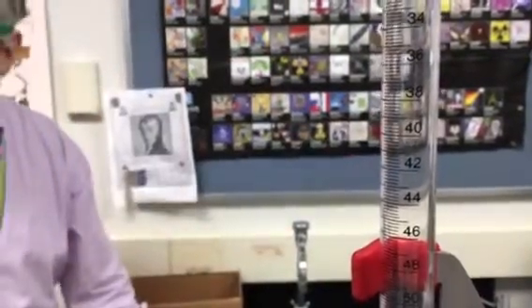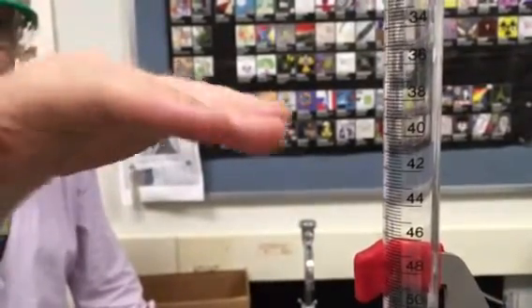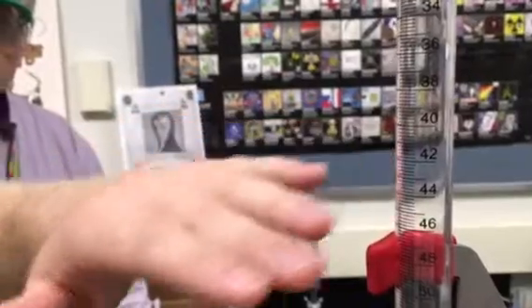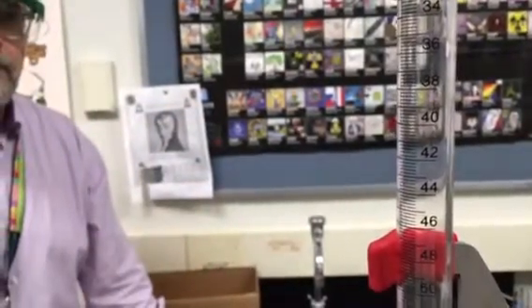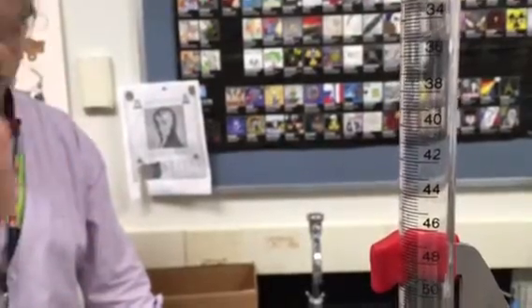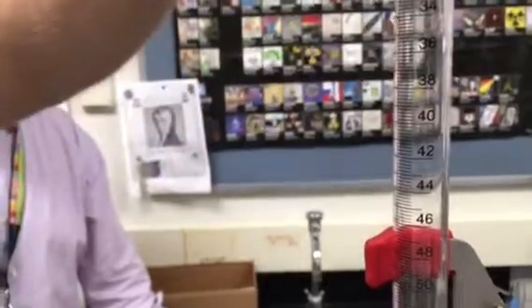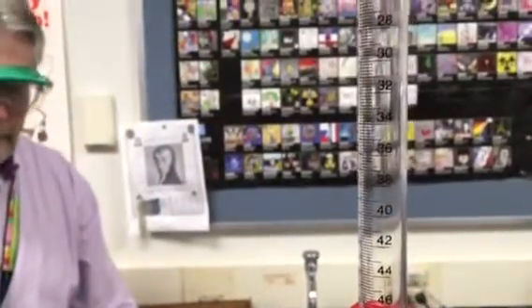Since it's 0.2, we really can't estimate the 0.1s, correct? This would have to be measured to the nearest single milliliter. I still think we estimate the tenths place. You're going to be measuring to the tenths here, but you're not going to go beyond that. So this one's a little tricky because it's 0.2s, not 0.1s.